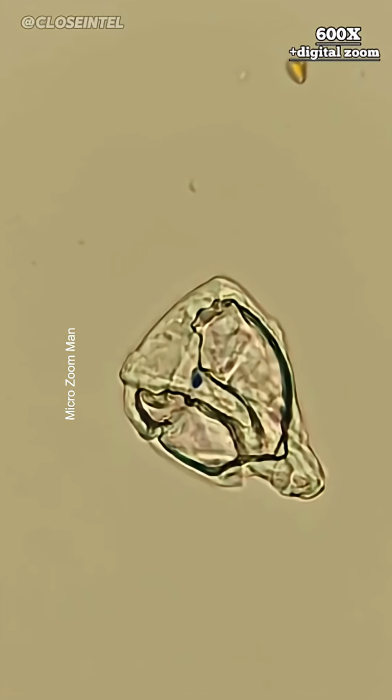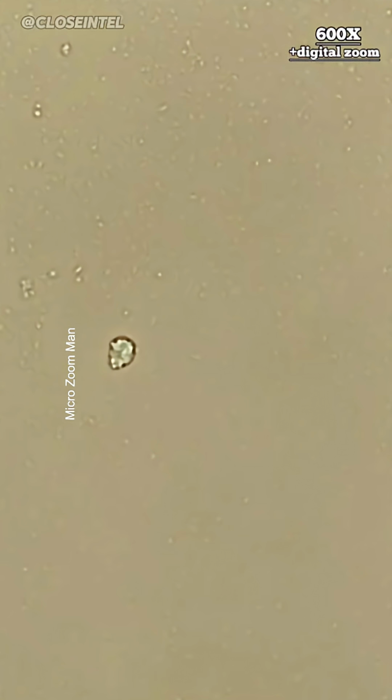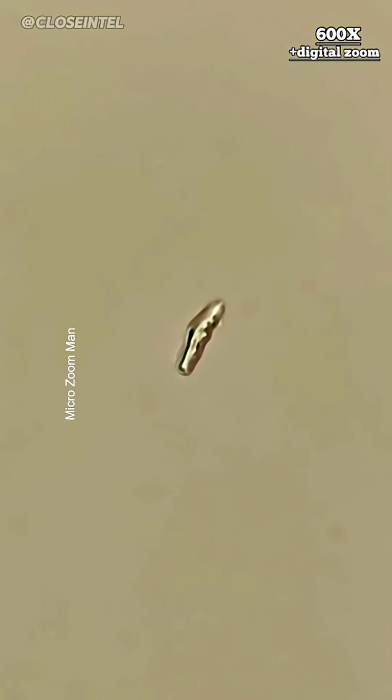Now, what about living things? We don't see much, if any, living organisms like bacteria or algae. That's because tap water is treated with disinfectants like chlorine to eliminate harmful microorganisms. So this absence of life is pretty much expected.